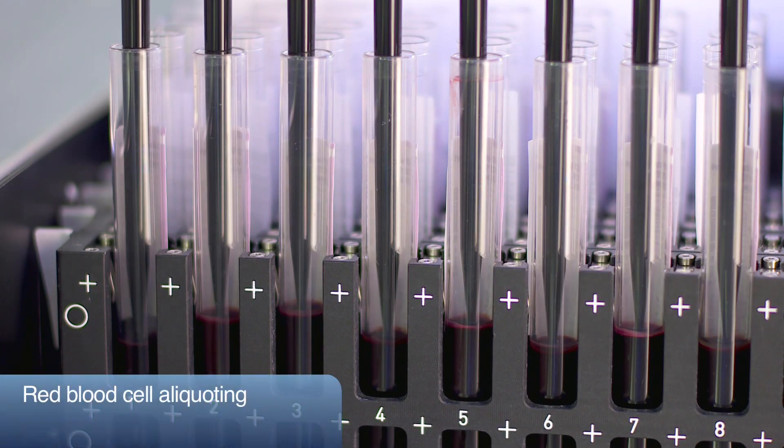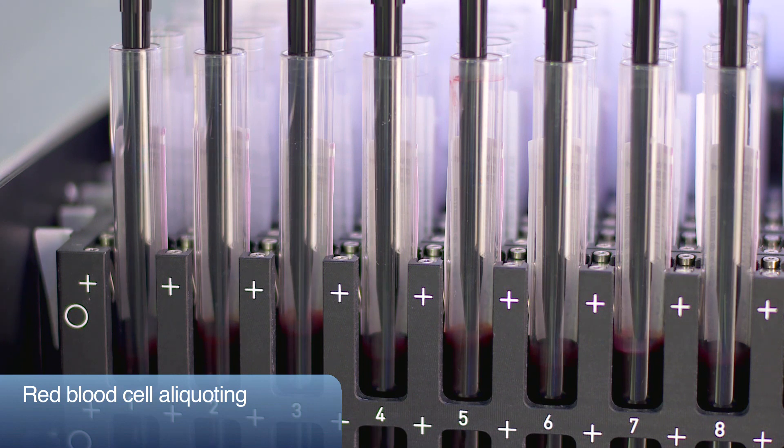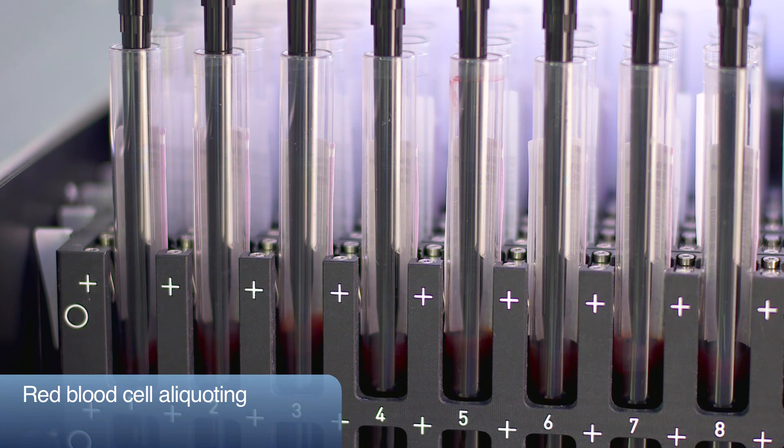If required, the red blood cells can also be aliquoted from the primary tube. To perform this action, a new and clean tip can be used, or the same tip used for the buffy coat pipetting to reduce consumables costs.